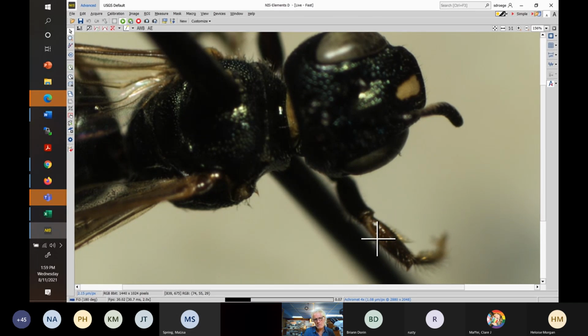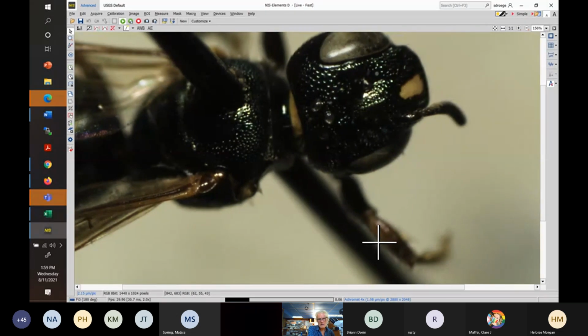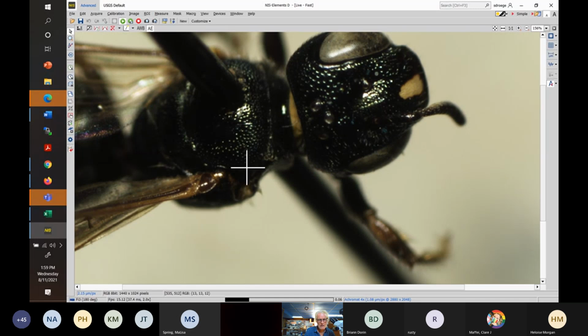It extends down, doesn't go all the way to the end. On the male, it does. On the female, it's just going like this. And the pitting pattern on here is dense, like dupla. The parapsidal line would be over here somewhere. And you can't see this super well, but there's multiple rows of pits along the parapsidal line in particular, and probably a couple here. Not helpful.